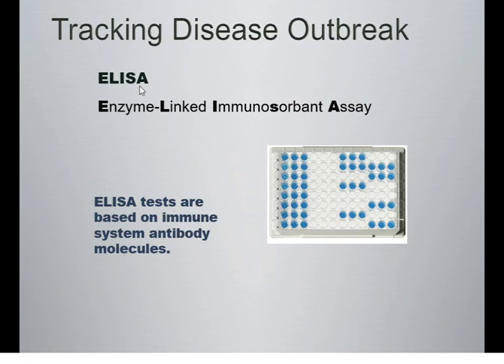You pee on it, the presence of a protein, a hormone that is generally found in urine after a certain number of days of a woman being pregnant show up. They go through this process and they show up positive or negative. That's essentially what an ELISA is. Pregnancy test is one of the most common types of tests done today.